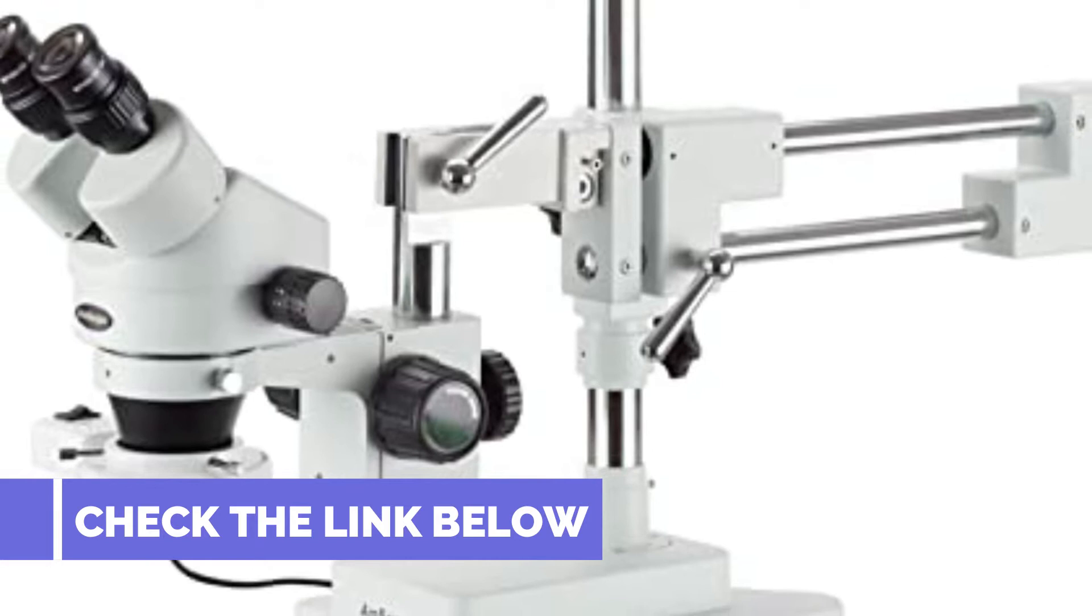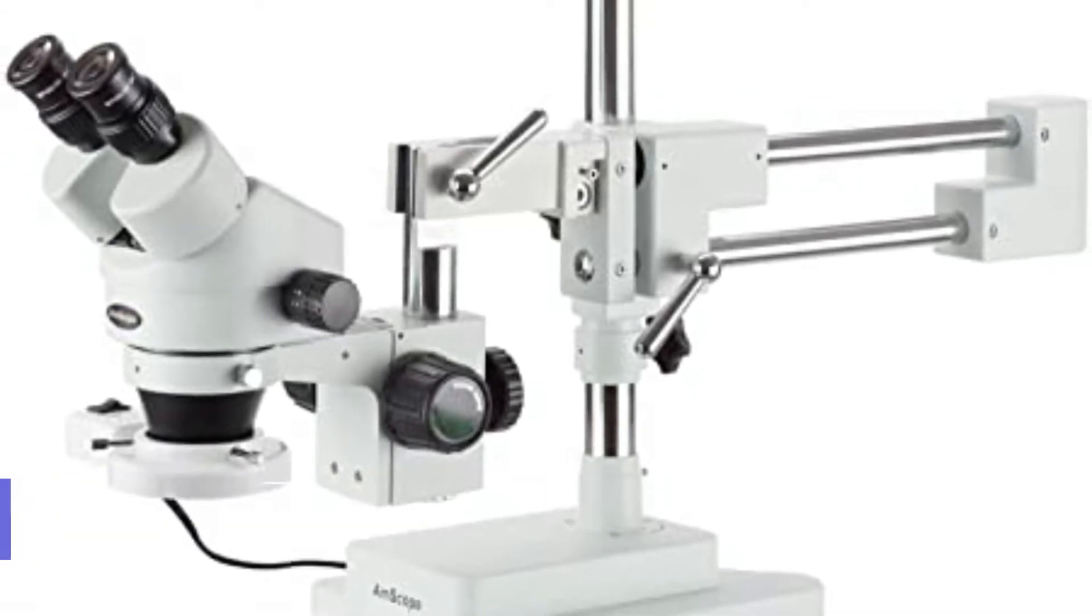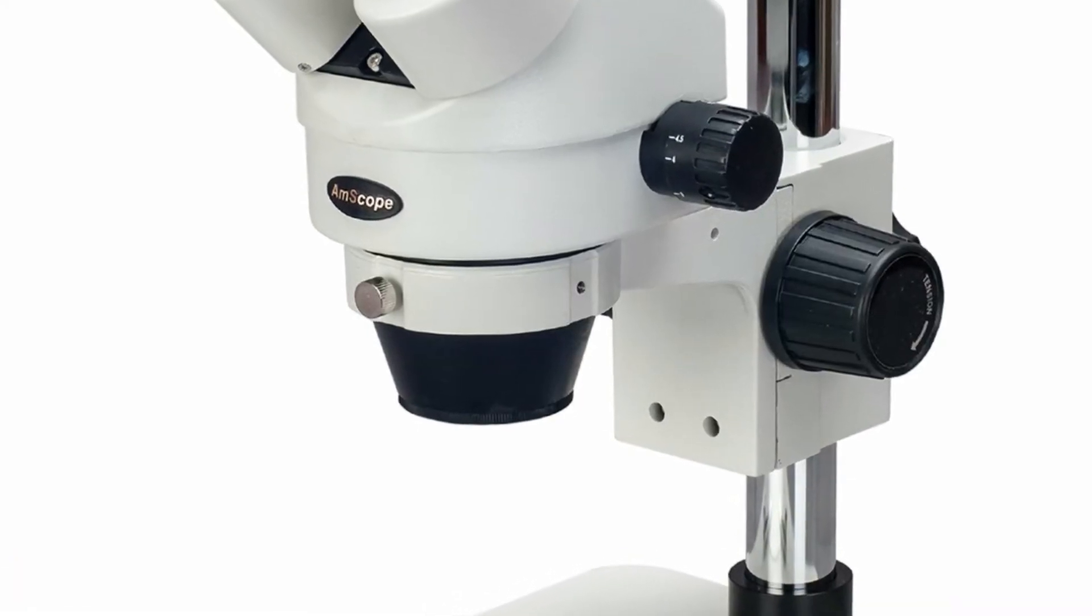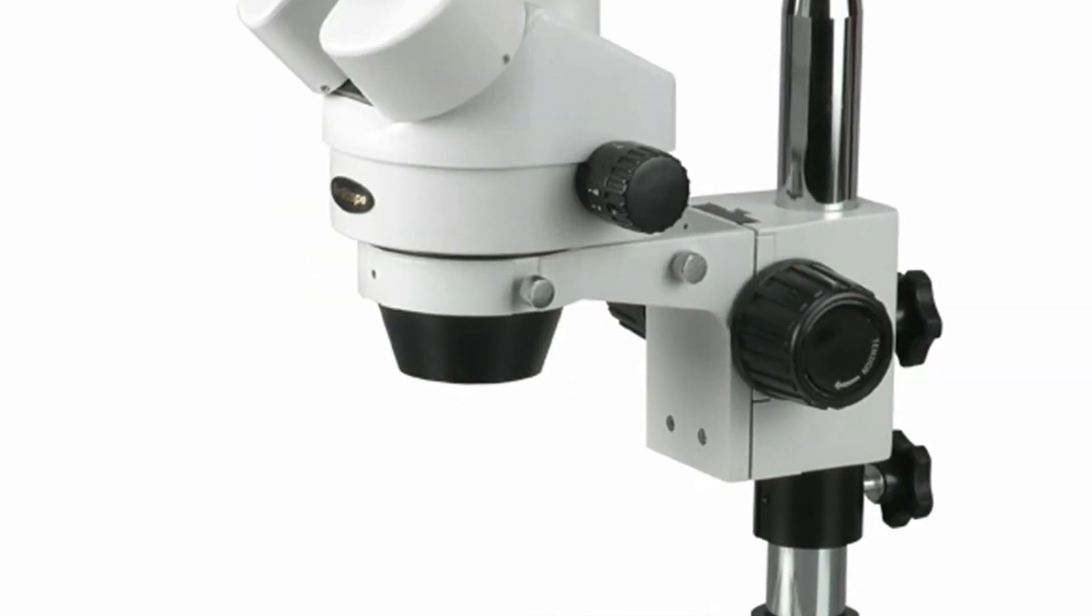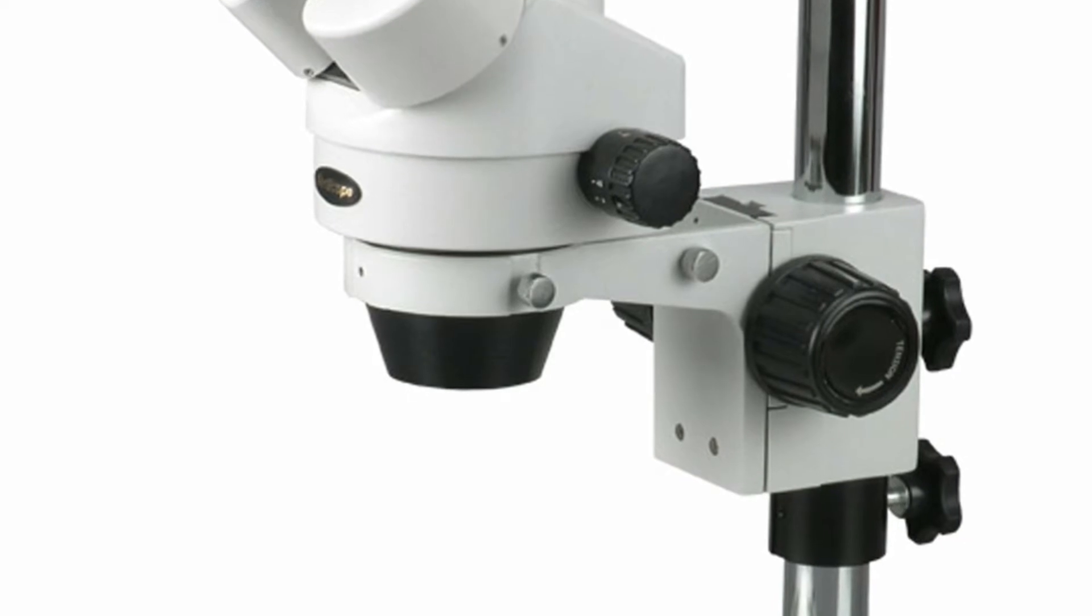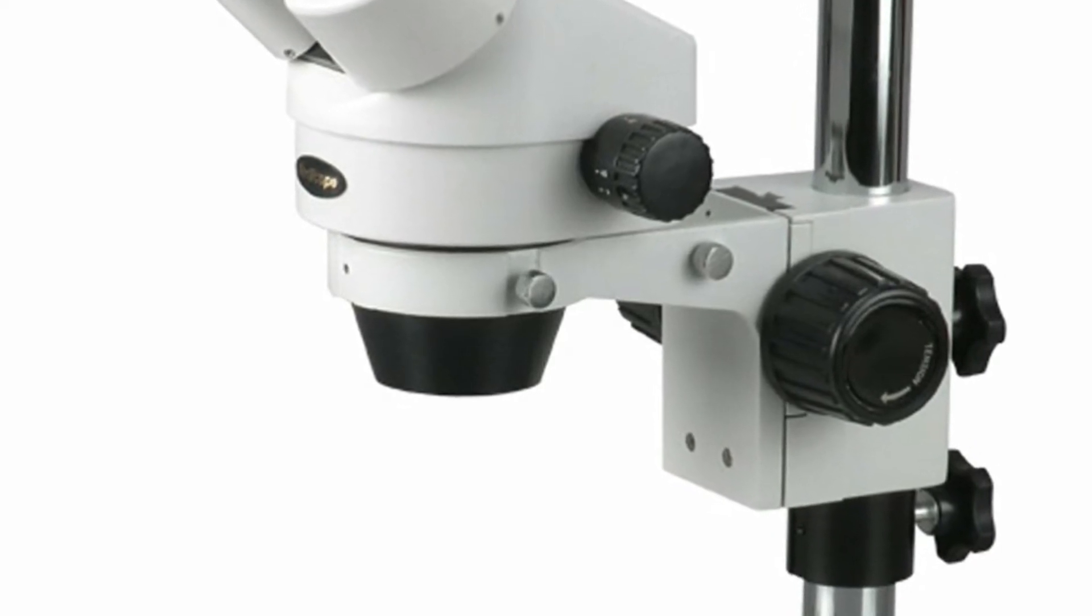This model features a zoom lock to maintain consistent magnification when needed and uses focusable eyepieces rather than integrated dioptric adjusters. With its wide zoom range and double arm boom stand, this model will become an indispensable instrument in any workshop or lab.